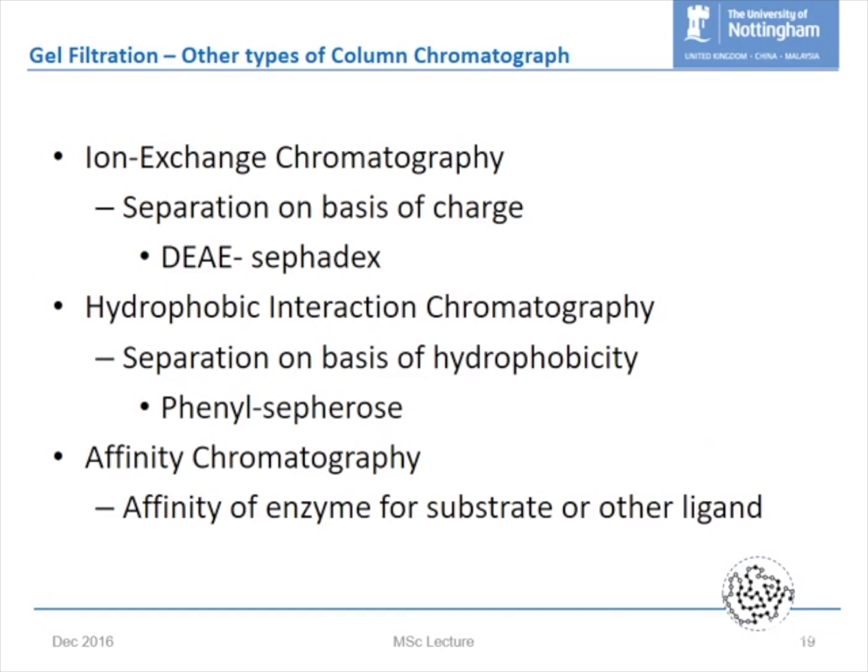Okay, so coming to the end, I talked about GPC this morning, and I put it in the context of general chromatography, but there are some other types of chromatography that might be relevant to biomolecules, and we've got a couple here: ion exchange chromatography, hydrophobic interaction chromatography, and affinity chromatography.